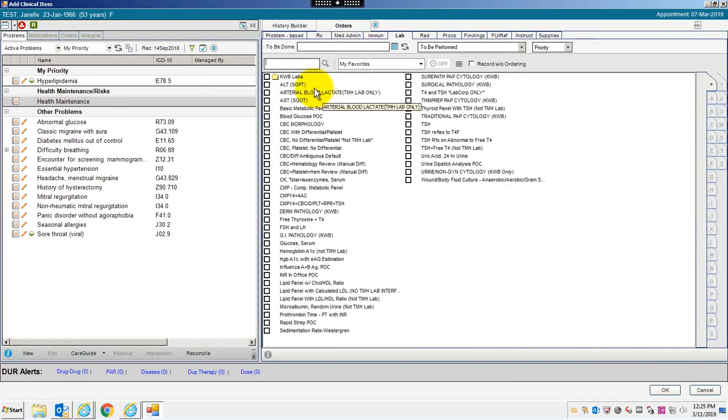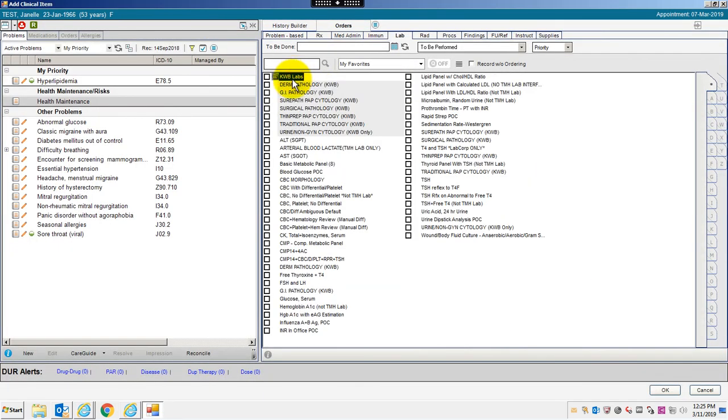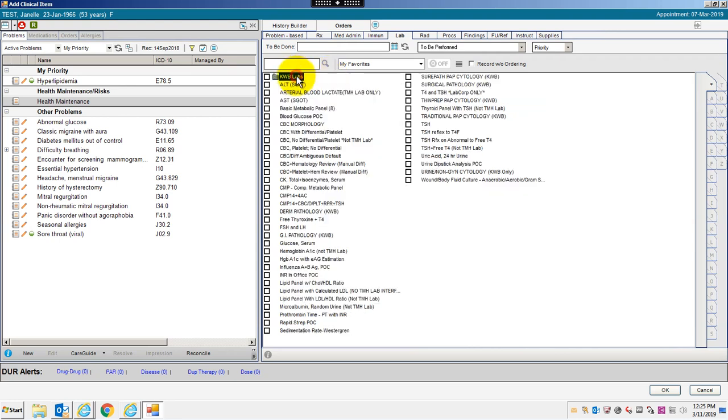So the ground we have covered is 7 new KWB pathology orders now electronically ordered and resulted. Required clinical questions to make sure results are obtained timely.